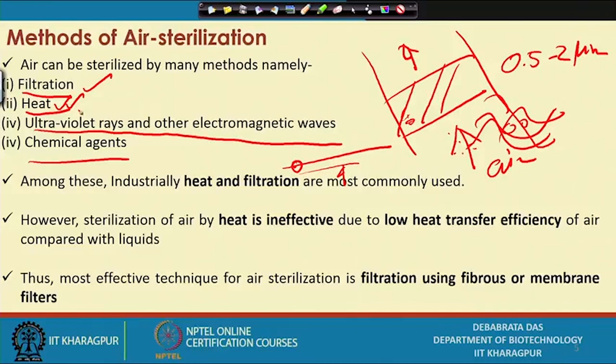Heat can be used, but when we consider air, sterilization by heat is not recommended. Why is it not recommended? Because air is a poor conductor of heat, so you require more heat for the sterilization of air, which is not recommended.